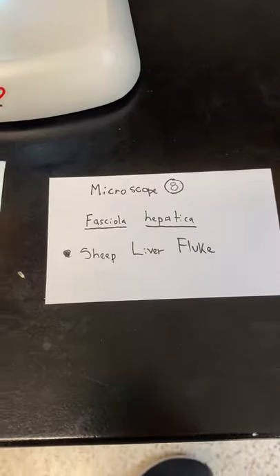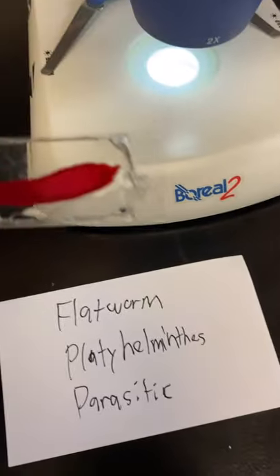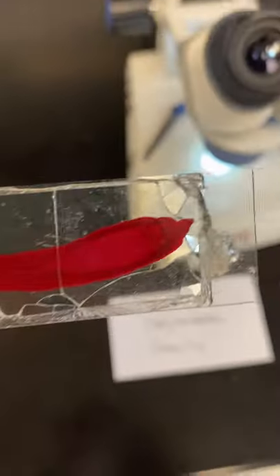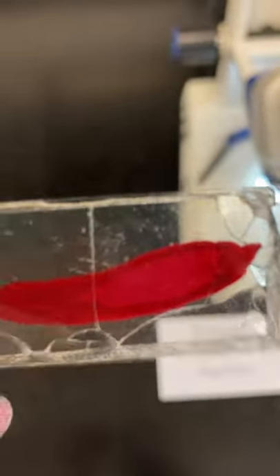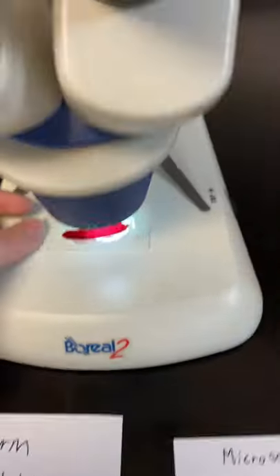Microscope eight: this is a sheep liver fluke. It's a flatworm, Platyhelminthes, and parasitic. You can see how large it is — you can actually see it completely right here, and I can't even see all of it on the microscope.